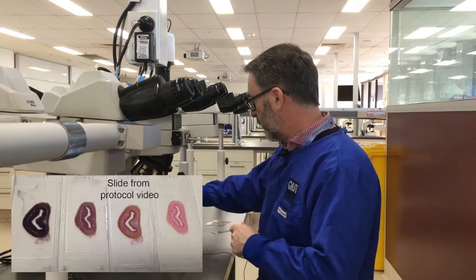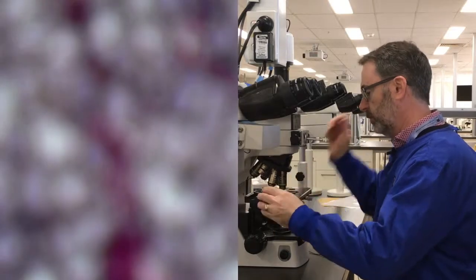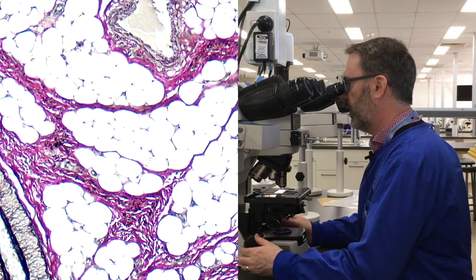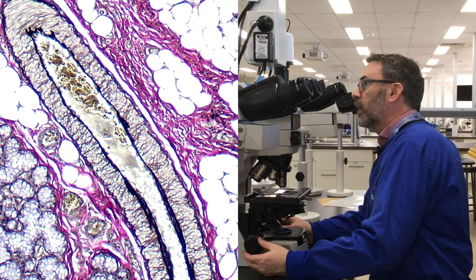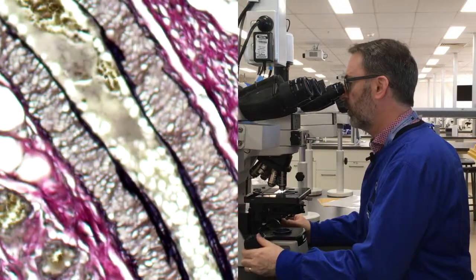Let's go to the extreme — this is probably very similar to what we would have seen had the slide had little to no differentiation. Under the time pressure of a staining exam, students don't always have enough time to complete these stains properly. I've left all the white balance and other settings the same to give you a better comparison.